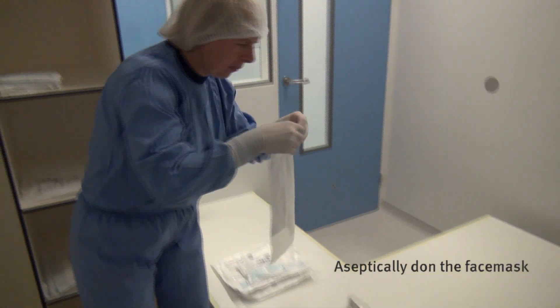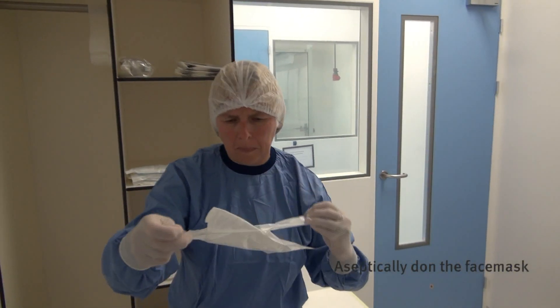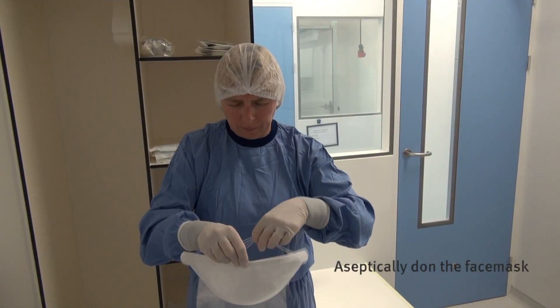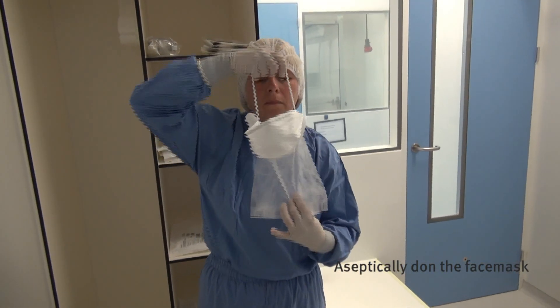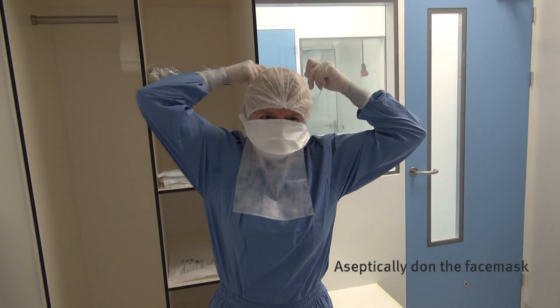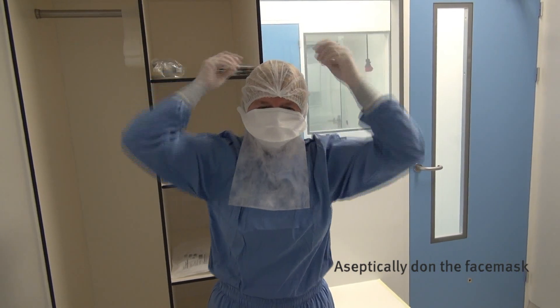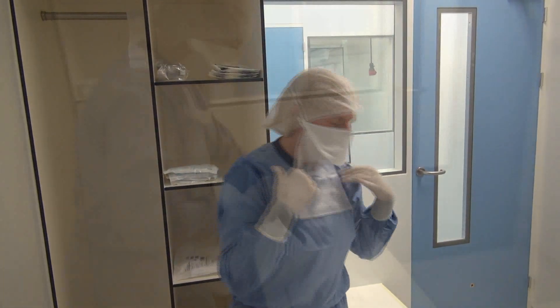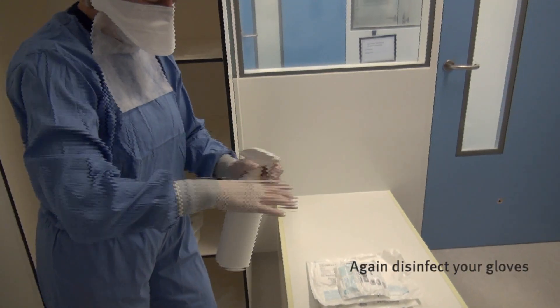Aseptically don the face mask. Prevent contact between your gloves and the head cover, face and undergarment. Again, disinfect your gloves.